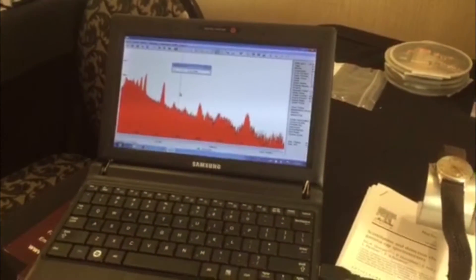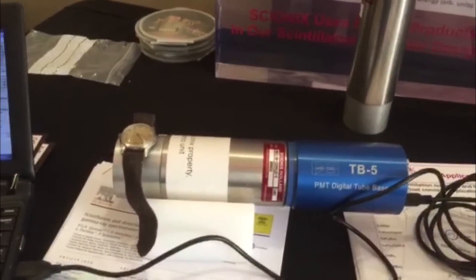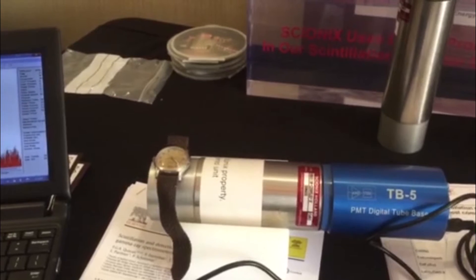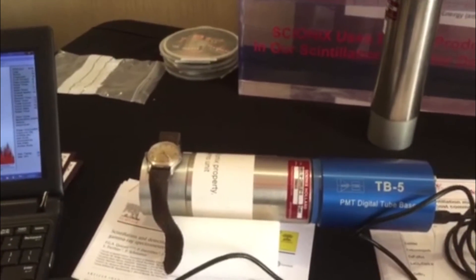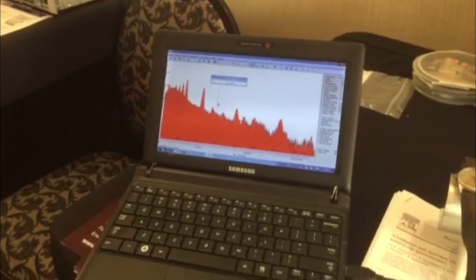The whole system is set up in two minutes. Cerium bromide is the latest scintillator technology that's truly commercially available, available from Berkeley Nucleonics and Psionics.